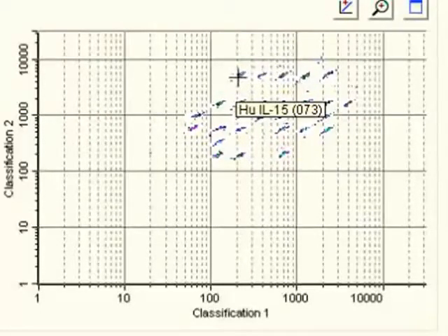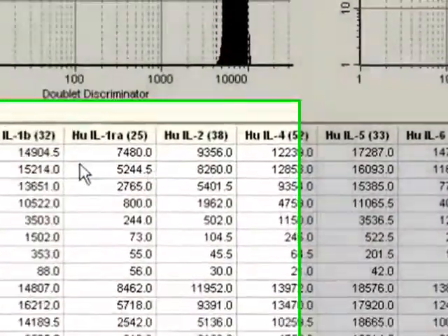Bead regions meaning bead types, or beads of different coding of classification dye 2 and classification dye 1. These are exactly the same dimension of bead. The only difference between each bead that's used is the coding of the two dyes that are on the beads, so that the instrument recognizes each bead in spectrally distinct locations on what's called a bead map.